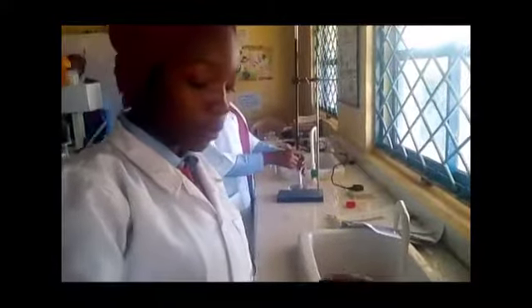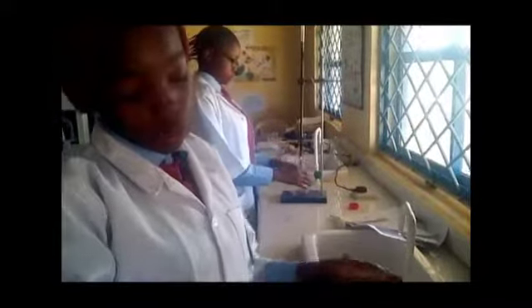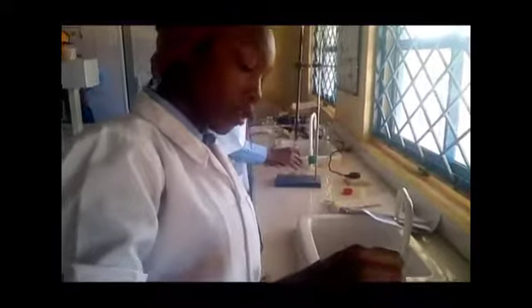This is dilute sulfuric acid. I'm measuring it to put into my oxalic acid. Since oxalic acid is a weak acid, it will not provide a completely strong acid medium. So dilute sulfuric acid is added in order to provide a strong acid medium.